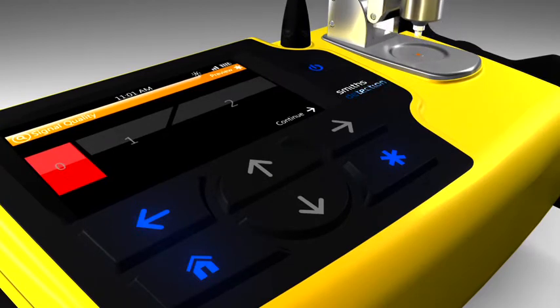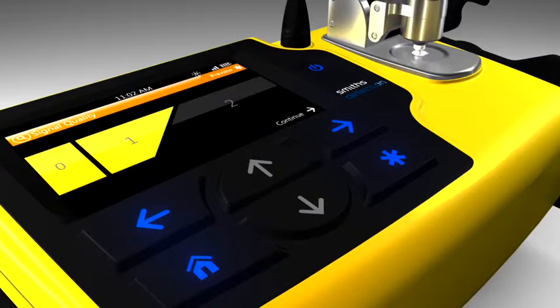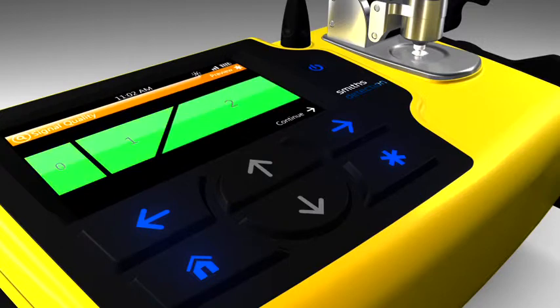Initially, this meter will read 0, be color-coded in red, and will fill only a slight portion of the screen. As the sample contacts the sensor, the reading will change to 1, turn yellow, and fill half of the screen. Finally, when sample loading is complete, the meter reads 2, lights green, and fills the whole width of the screen.